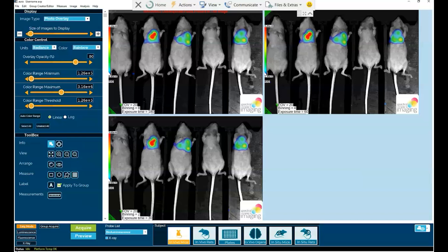And finally, smooth blend, a novel proprietary data display that enables rapid data acquisition at maximum sensitivity settings without any compromising of image quality, both aesthetically or quantitatively through ROI analysis.